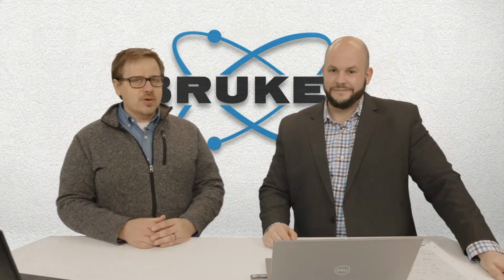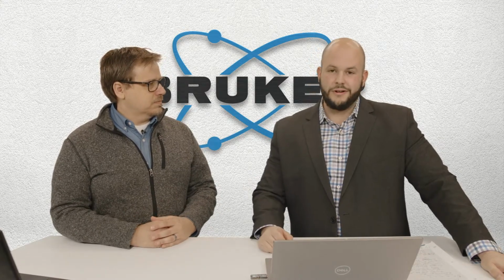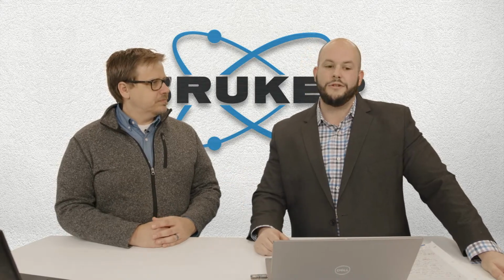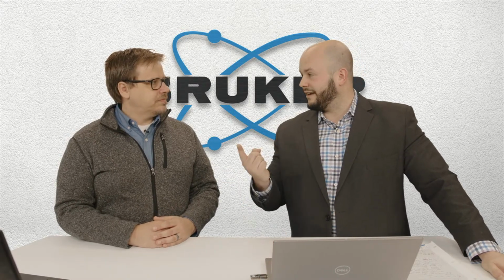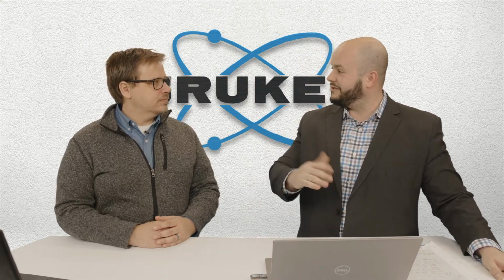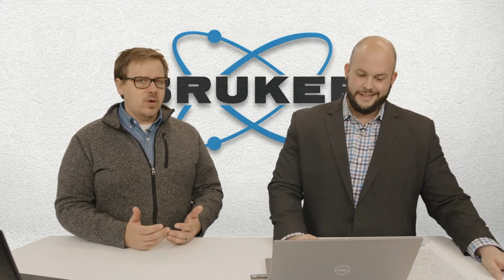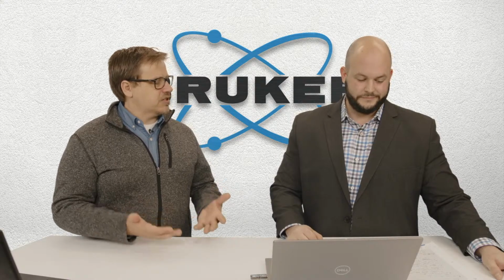So today's topic, we're going to talk about X-ray reflectometry. That's right. So Bruker has spent a lot of time developing software for refinements and things like that to help us determine the thickness, roughness, and density of the individual layers in our thin films that are on top of our substrate. So let's talk a little bit about what X-ray reflectometry actually is, though.